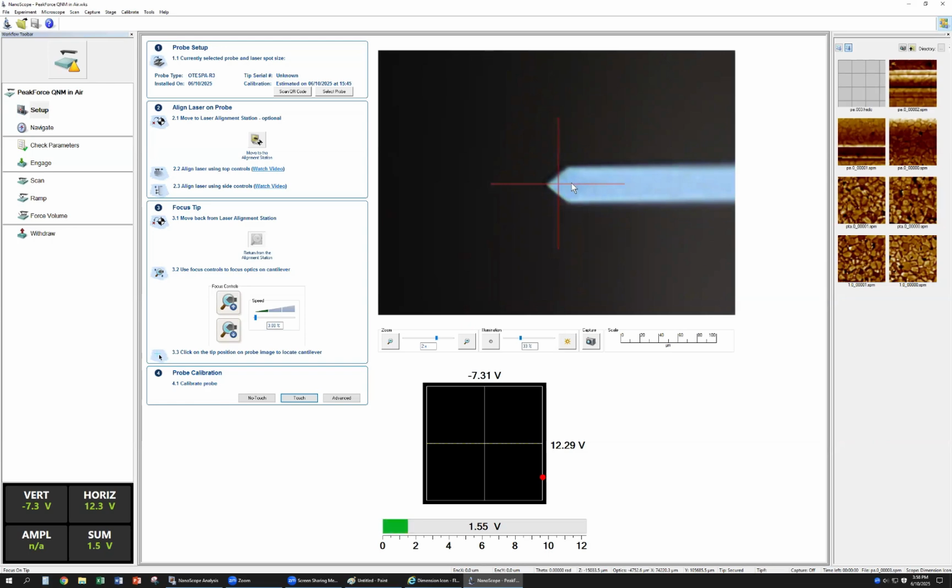Normally for locating the probe, you put the cross around this triangle shape. Okay, because then all the probes are here. The probe is not here. Okay. Then you adjust this one to the center. Okay, adjust this one to the center.